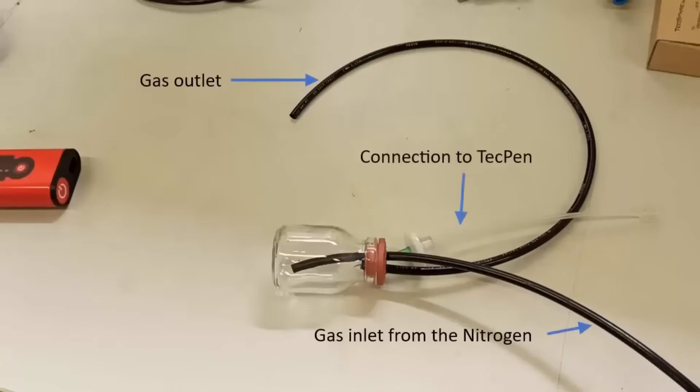The connection to the TechPen can be done via a needle which is on a filter connected to a hose. At the end of the hose should be a luer lock connection.